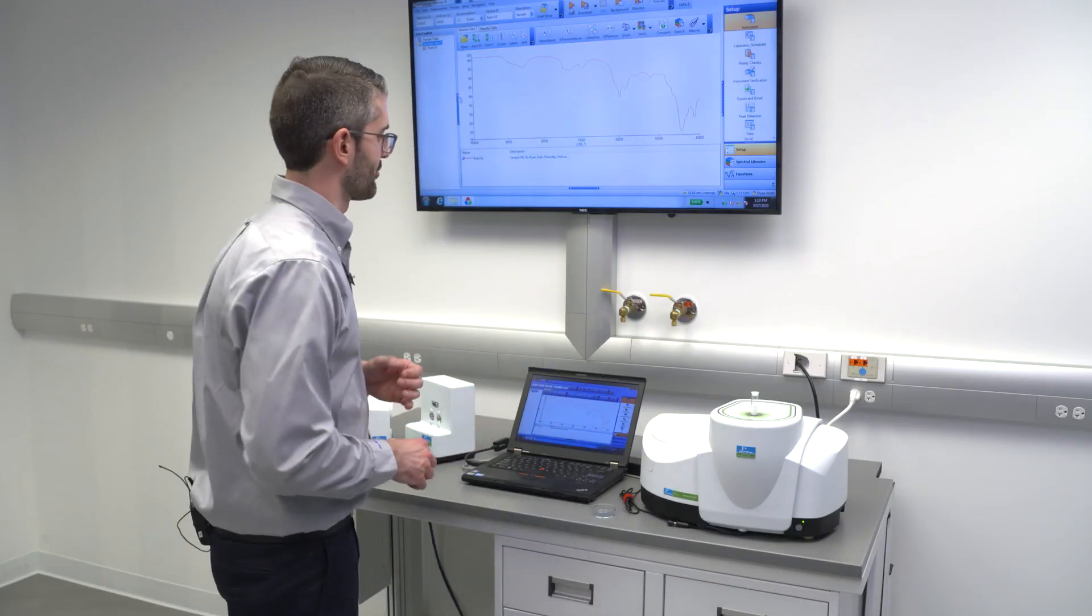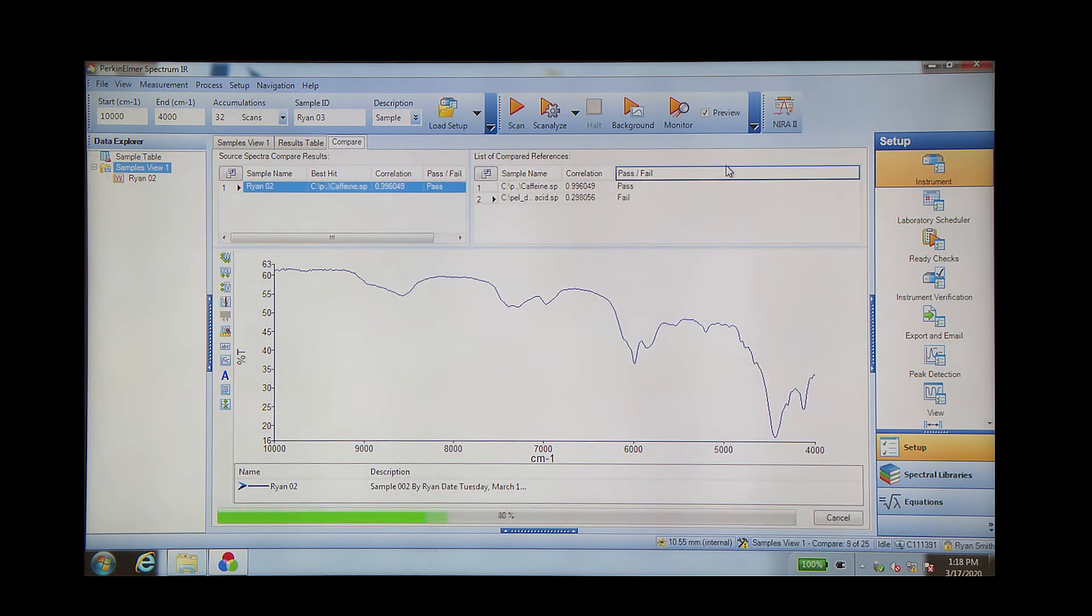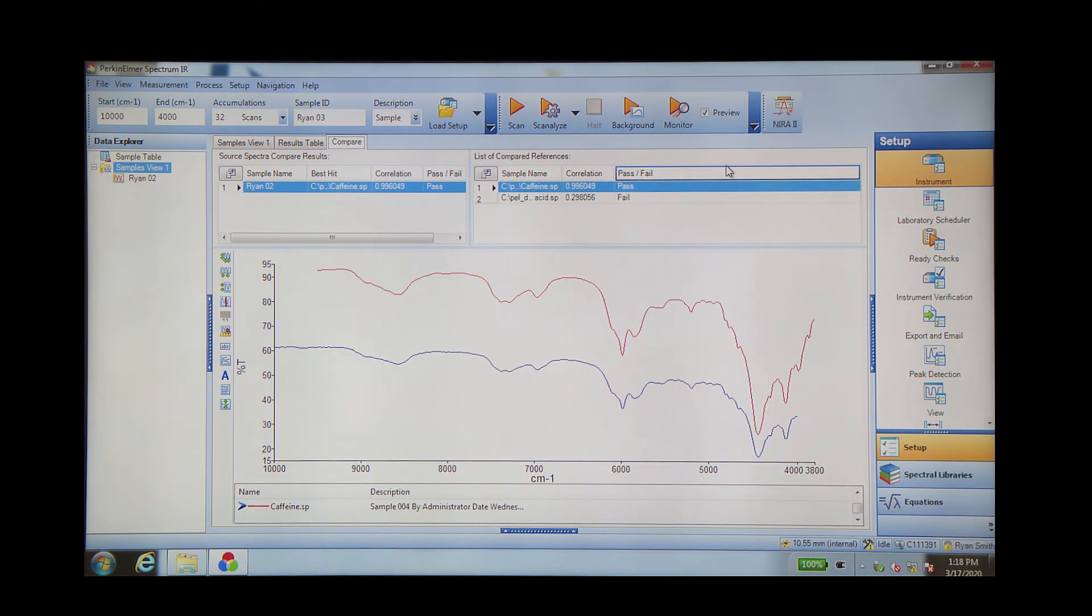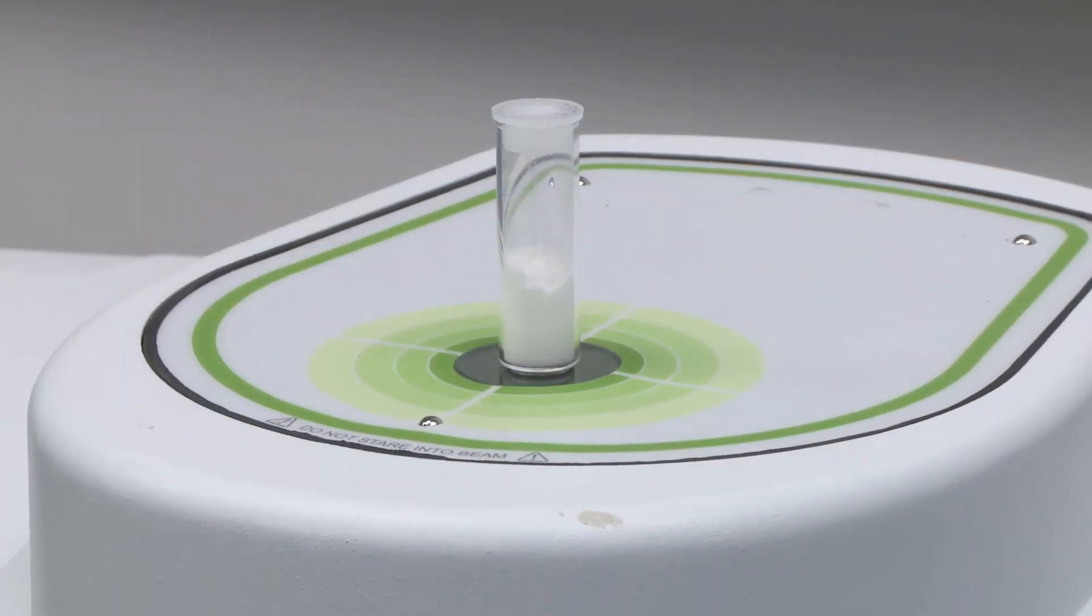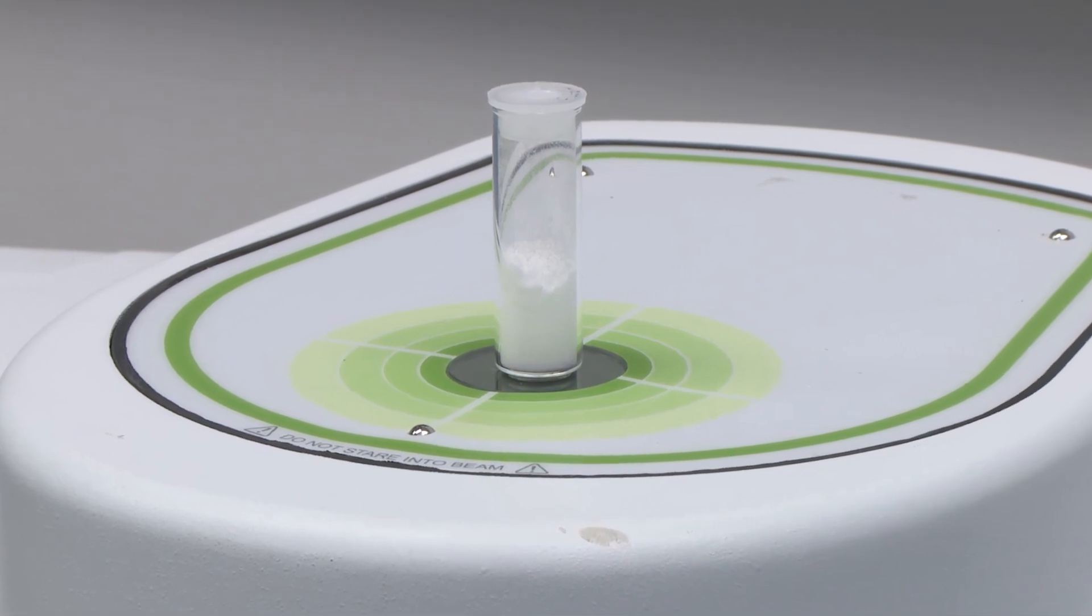To perform this comparison in the software, we simply click the Compare button. The software will then automatically go into the reference spectra which the user has saved and perform a correlation calculation between the measured test sample spectrum and the reference spectrum which was previously measured. Here we see that our correlation is 0.996, showing that our best match is for caffeine. This tells us that the sample in the vial is in fact caffeine because the correlation value is very high.